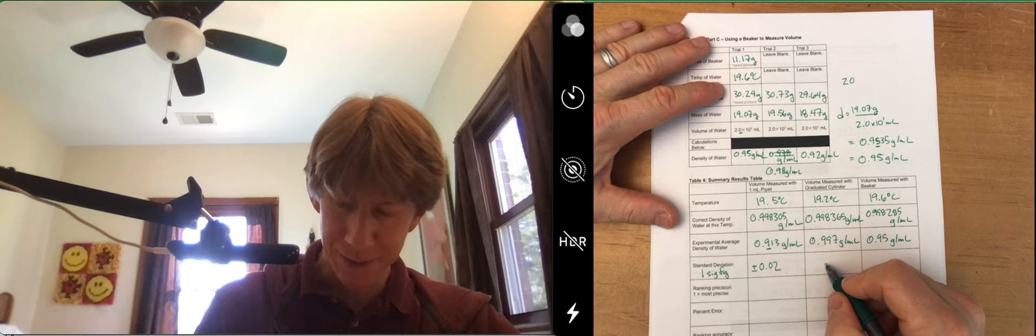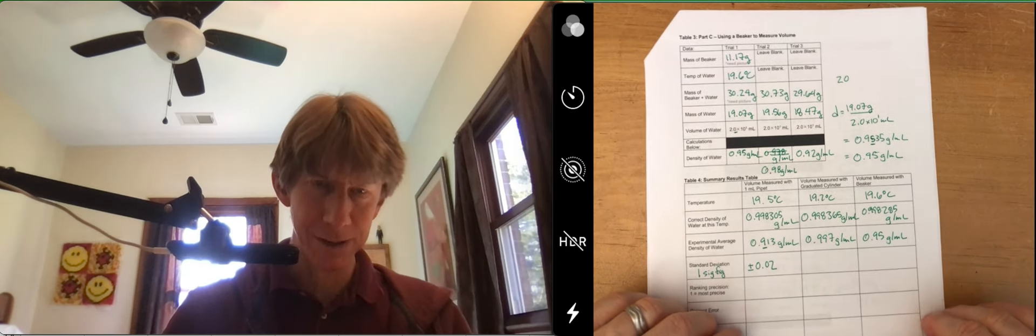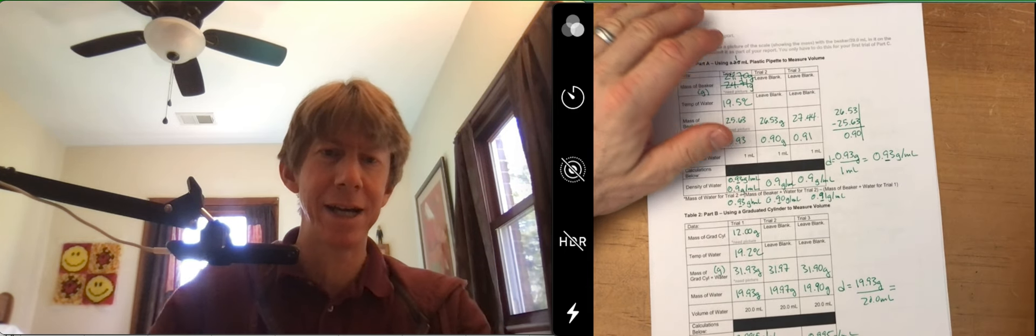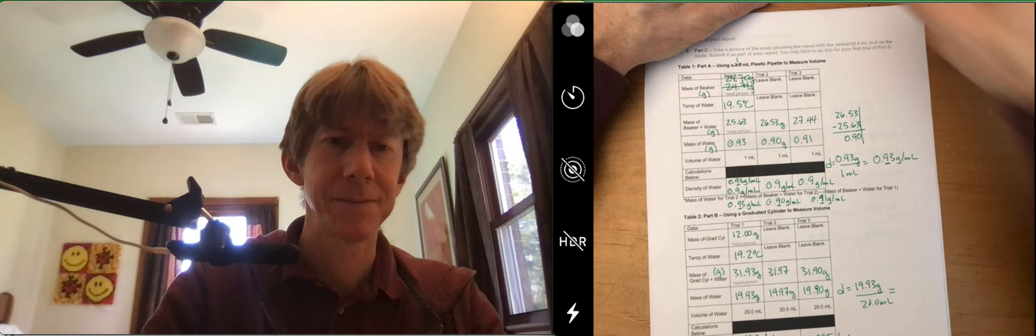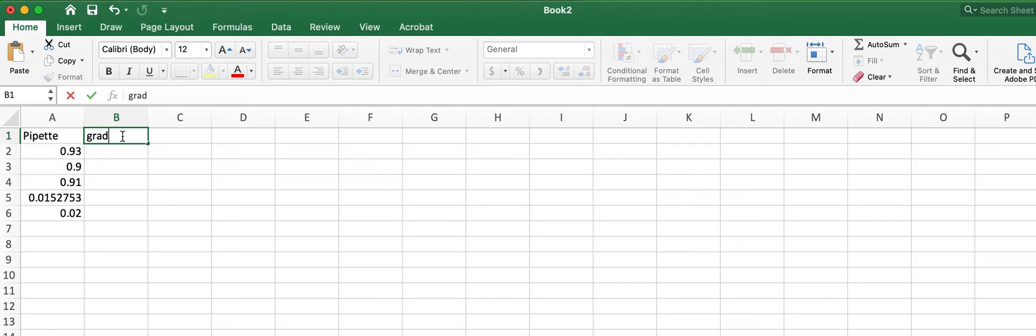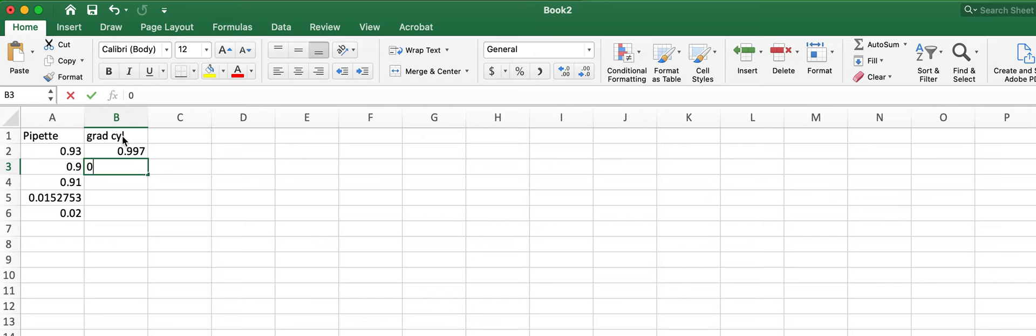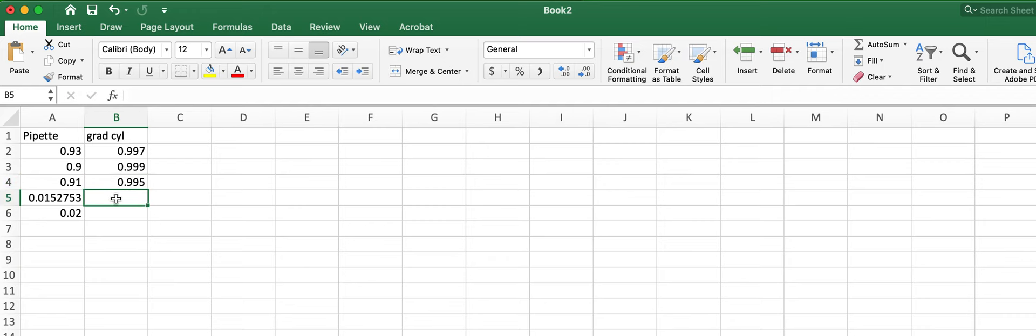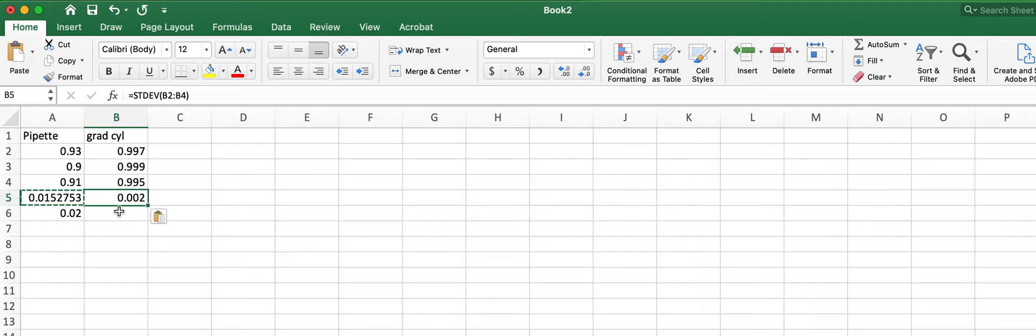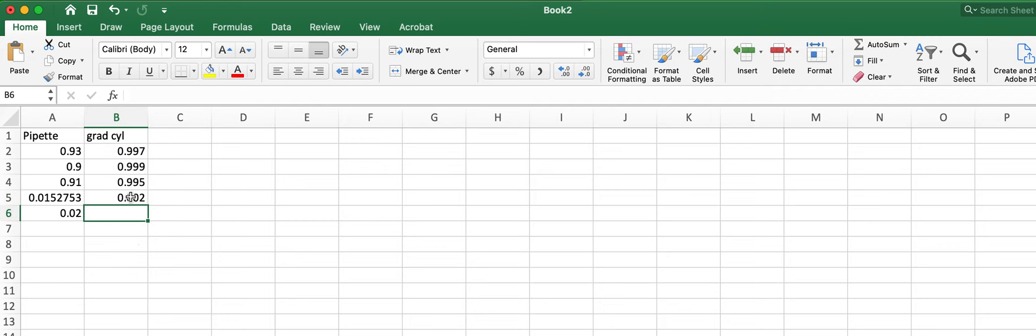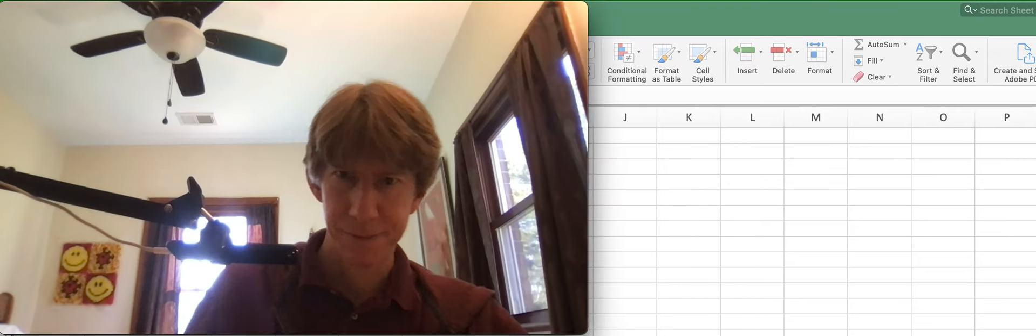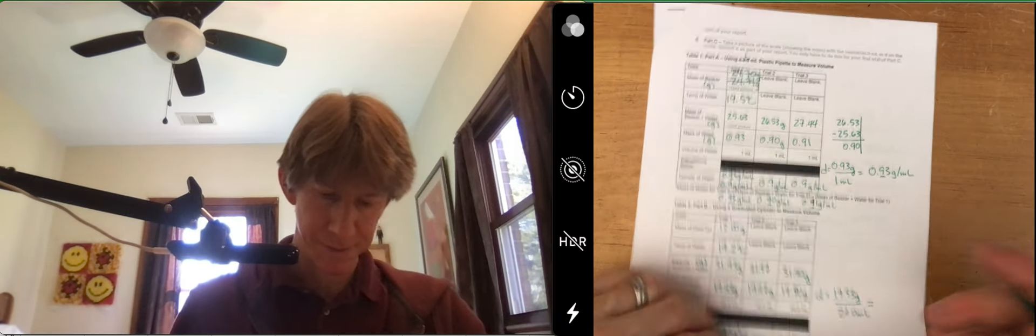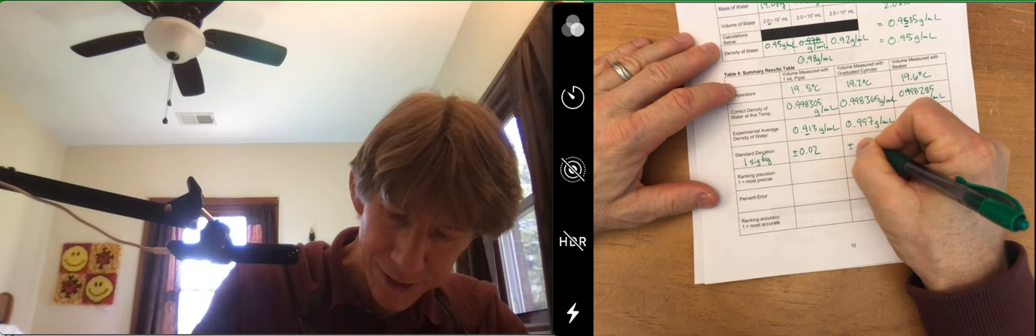But for now, for this one, 0.997, enter in your three values. 0.997, 0.999, and 0.995. So this is grad cylinder. Now, you can type the formula in again, but if I copy and paste this one, it will reference these three values, which is exactly what I want it to. And I get 0.002. And that's going to be plus or minus 0.002.